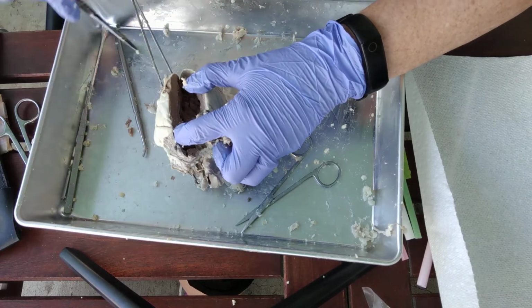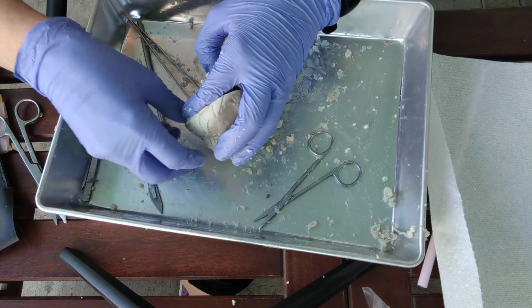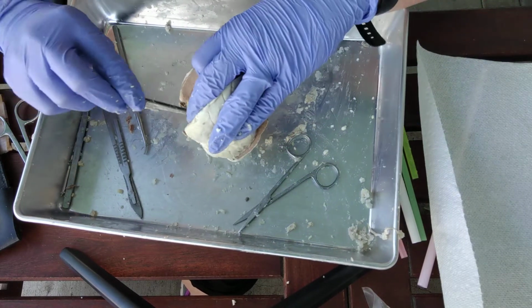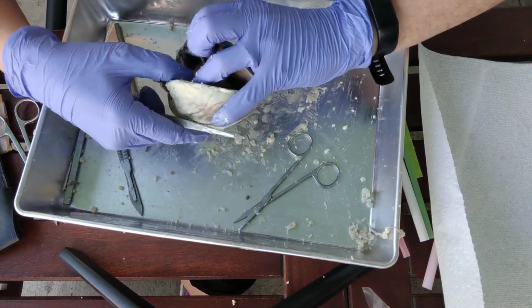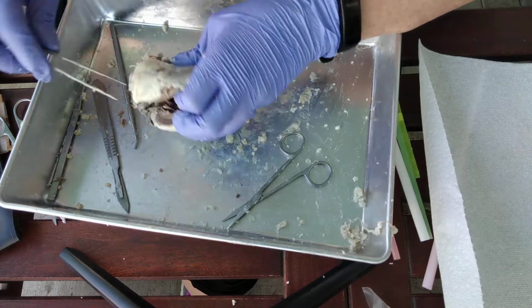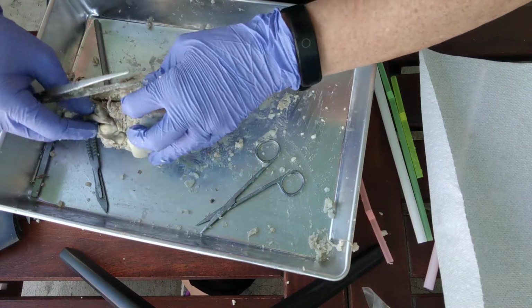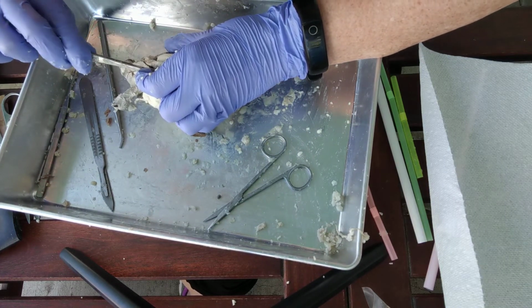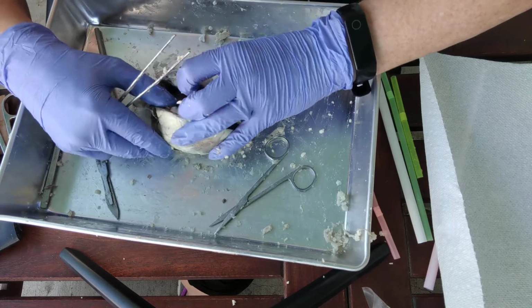If you want, you can cut through your bicuspid valve. And the advantage to doing that is if you can look really deep in there, you can actually see the aortic valve. Okay, so you can actually see how it kind of comes up and it'll come out through the aorta. So if you see any little flaps, little white crescent flaps, those are going to be semilunar valves. And if you're in the left ventricle, that's going to be the aortic valve. And if you are in the right ventricle, that is going to be, where is it? Oh, sorry, wrong place. That is going to be the pulmonary valve. Okay, so semilunar valves, no strings. Tricuspid and bicuspid valves, strings. That's one way to identify them.